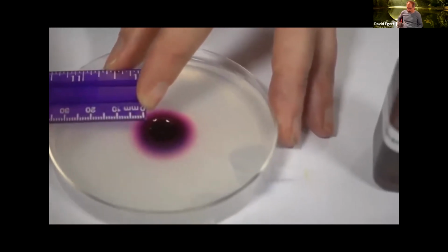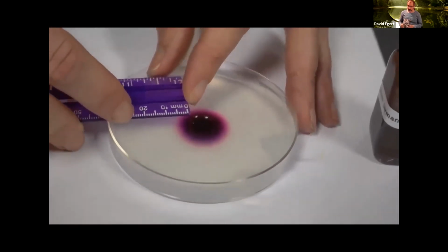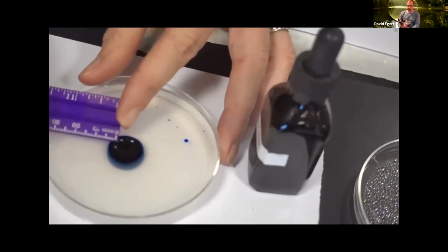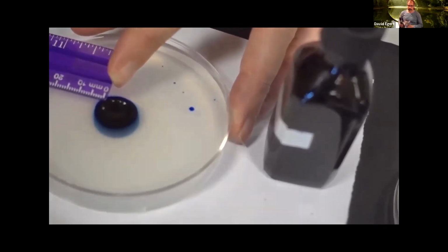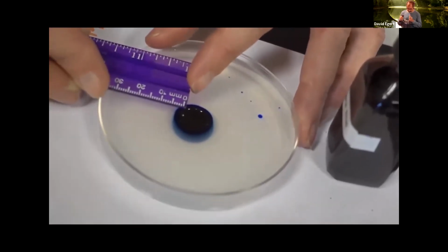It looks like 4 millimeters in 30 minutes, or 4 millimeters in a half an hour. And then when we go over and look at the methylene blue, it looks like it's diffused about 2 millimeters out in a half hour, or 2 millimeters in 30 minutes.